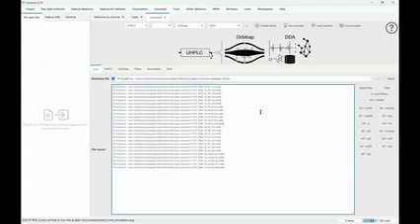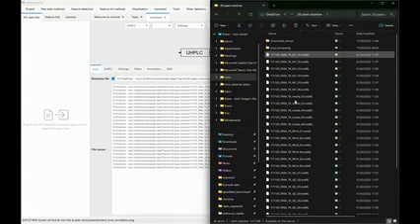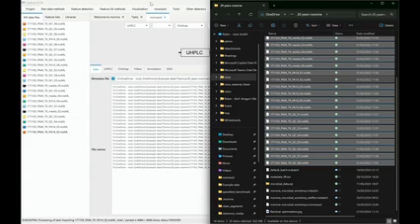I know that Steffen typically prefers to just drag and drop again. So you can always also just drag and drop the files. So you select all of them, drag and drop them into this box. If you drag and drop them into mzmine, you're going to see that it already starts importing the files. But don't worry, we want to import them afterwards, right? So that's also going to work.